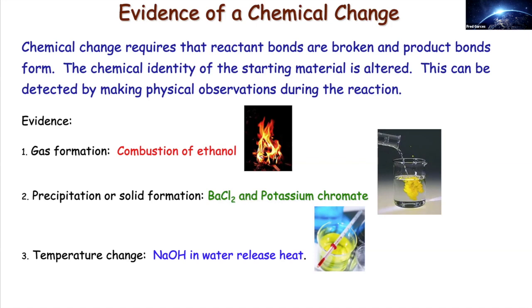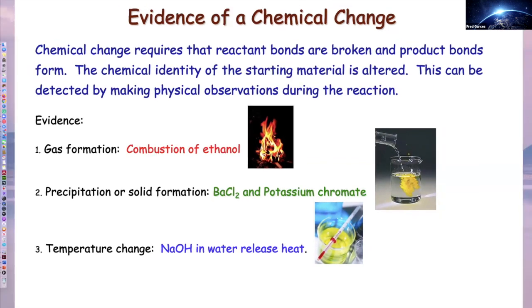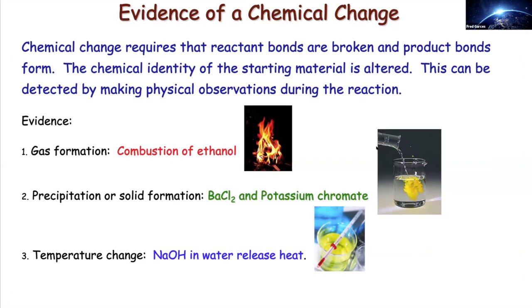I'm just giving a PowerPoint discussion at this point, showing the students what this experiment is about, and going through the different modules these guys are covering. This is the PowerPoint slide for those of you who just arrived, and I just talked about what you guys are going to be writing down in your observations, that is, that a reaction has taken place. When you see a gas, make sure you indicate in your observation that a gas has formed. If you see something burning, make sure you write that down. If you see a precipitate, make sure you indicate that in your observation. Temperature change is very difficult unless there's a thermometer involved in the reaction, or the narrator of the movie tells you that it becomes hot or becomes cold.